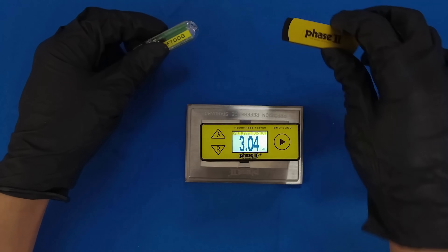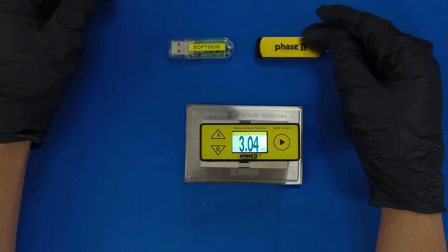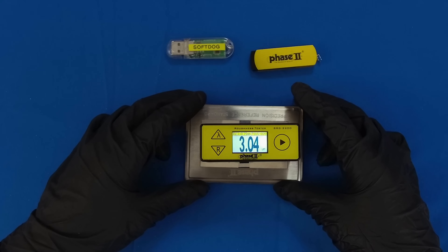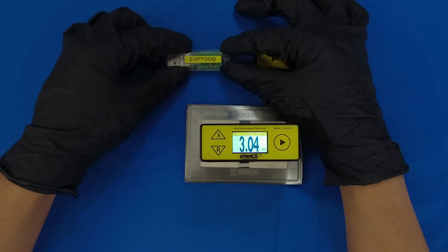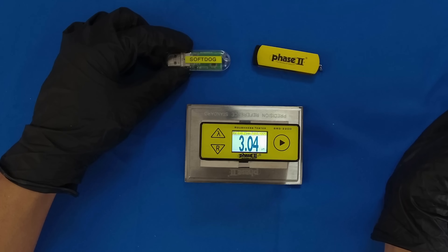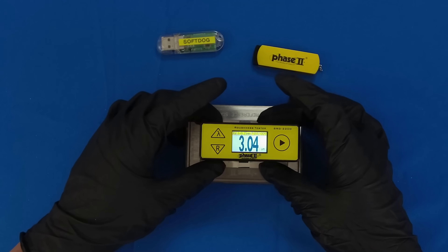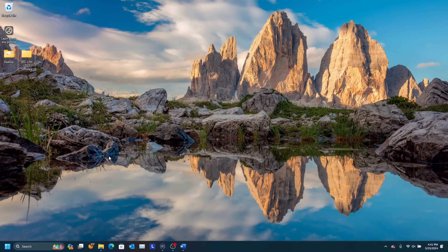For data output, simply plug the USB dongles into your computer. The right USB contains the program that the SRG2200 will connect to. The dongle on the left is a Bluetooth receiver that allows the SRG2200 to connect to the computer. Note that this receiver is required to be plugged in for the SRG2200 to connect — standard forms of Bluetooth communication will not be accepted. First, extract the contents of the SRG2200 data output software to a location on your computer, then make sure that the soft dongle is plugged in.